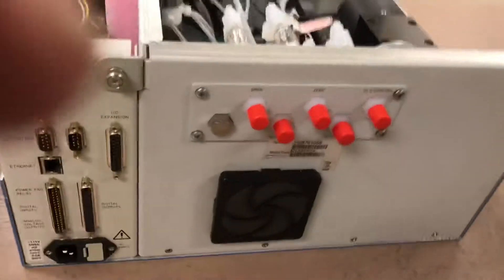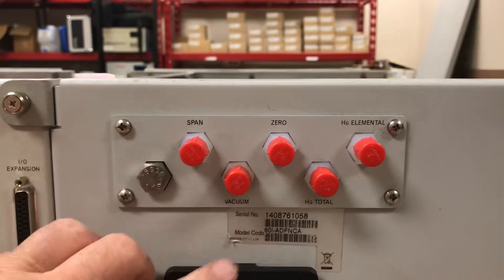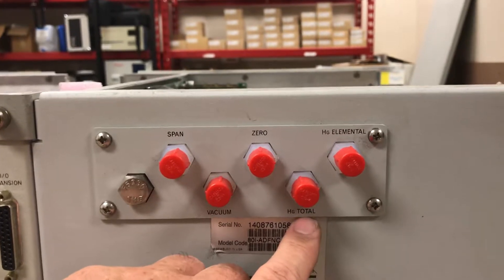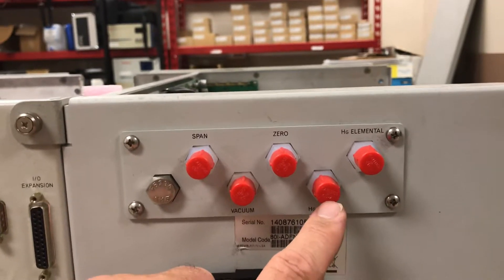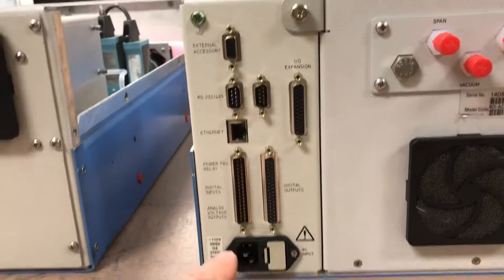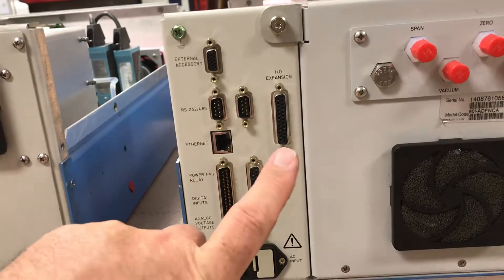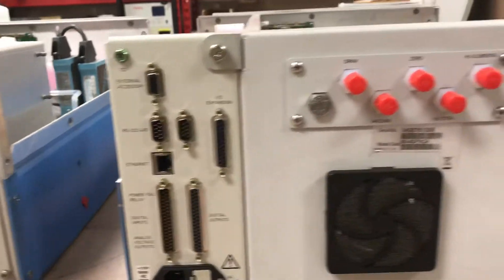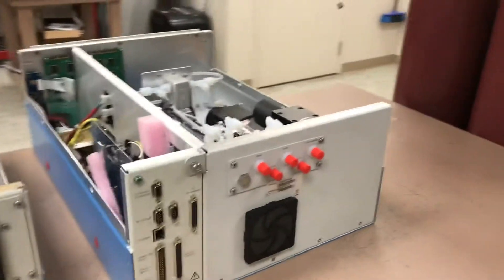Looking around the back of the 80i unit, there are connections for span — which will come off the calibrator — as well as vacuum and zero air. There are umbilical connections coming off the stack for mercury total and mercury elemental; these two lines come off the umbilical from the stack mercury sample probe. Electronics are very similar to the i-series: Ethernet port, digital inputs and outputs, IO expansion for 4 to 20 milliamp output, and RS-232/RS-485.